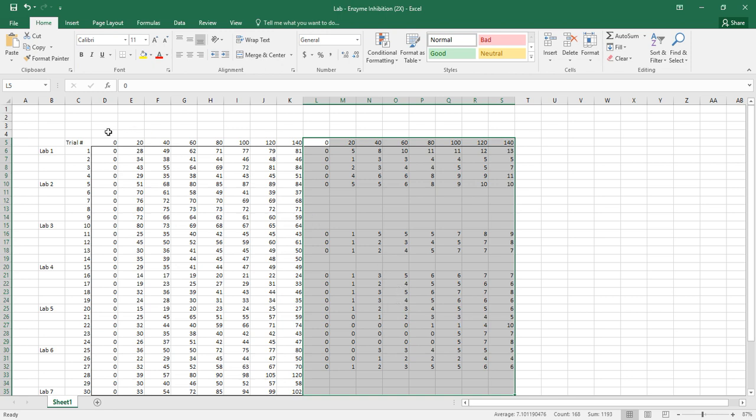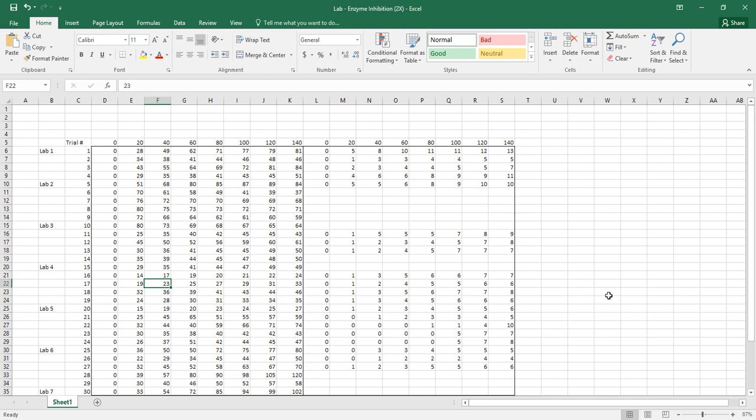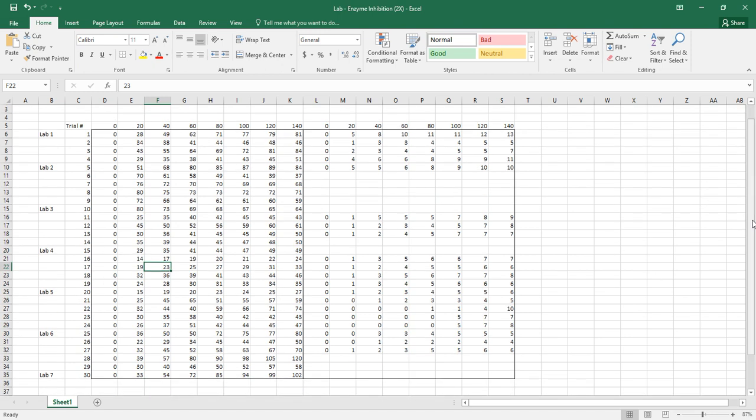We would definitely want to label these up here as time, time in seconds. Down here is the trial number, and these, if you recall, represented the amount of oxygen gas that was released. We would normally want this labeled over here, but we're not making the graph or the table today, so you don't have to worry about that. I'm sorry, I've done this several times, and I'm losing my line and getting tired. All right, let's go ahead and get to making the graph.